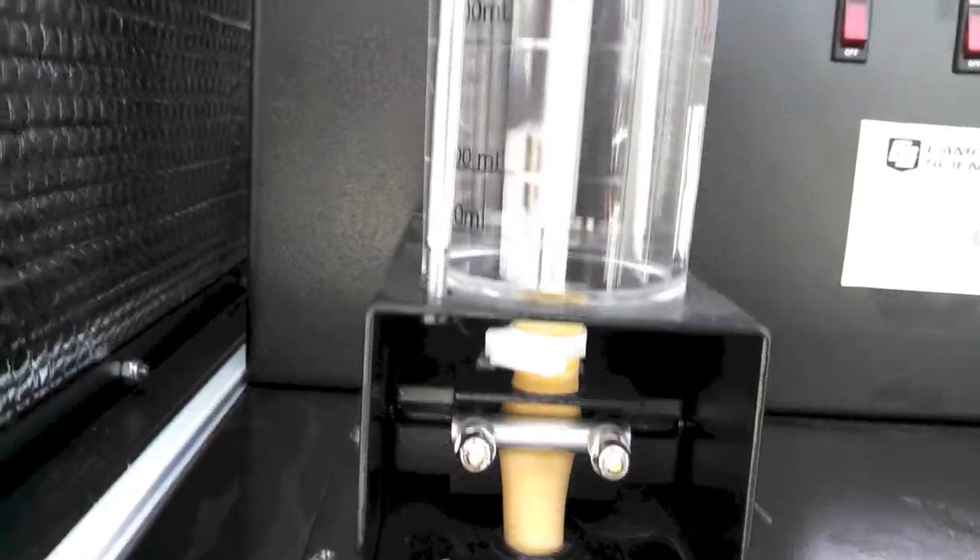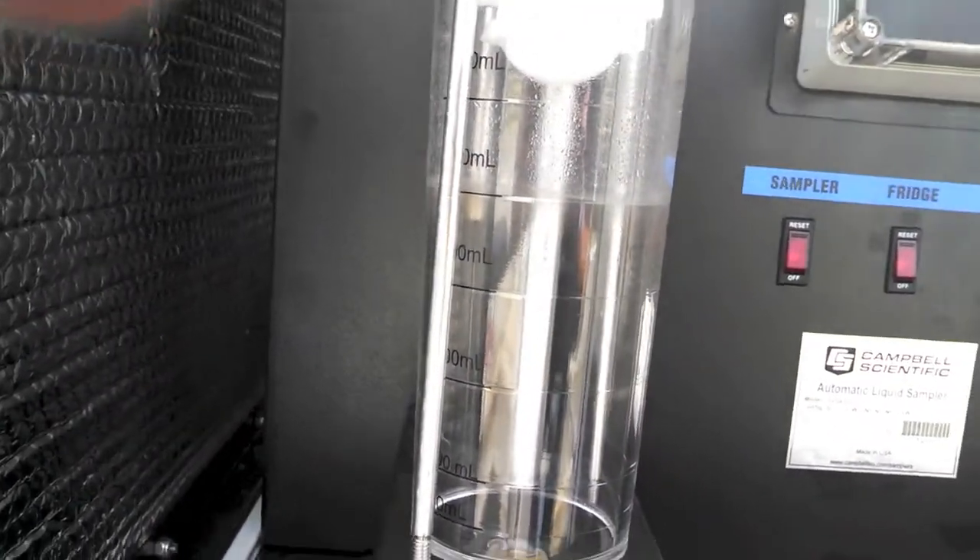The valve is now back open, and it's closed now. And it's purging — we can see it bubbling back out again.